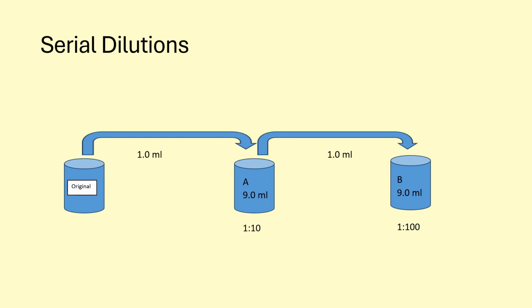So like I say, you'll find that for several situations, you may be working with a very concentrated sample. It can be solid, it can be liquid, whatever it is, and you have to dilute it out to try to get a number. Why is it so important to know what the concentration or what the number of bacteria per gram or per mil is?